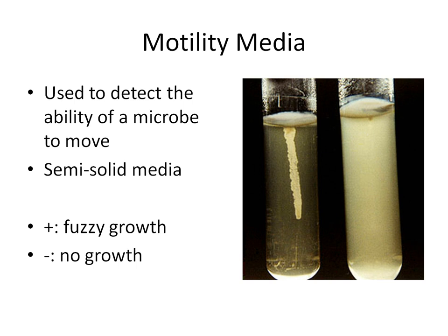Today, one of our media is going to be a semi-solid. This is a media that, when applied to a test tube, is too solid to be able to be shaken and move around like a broth, but it is too liquidy to hold that slanted appearance we see with our solid agar placed in a test tube. The way we know it's motility media is we look for the flat top that is not liquid in the test tube. Semi-solid media is used to tell us motility.